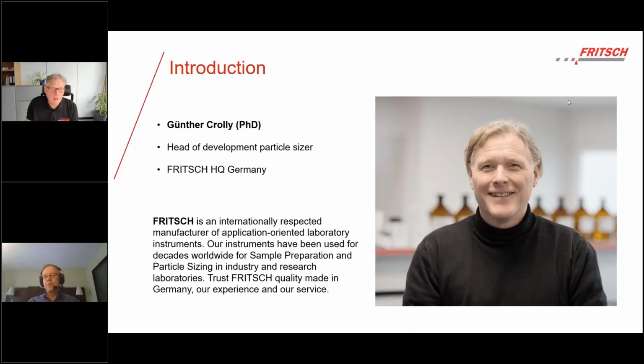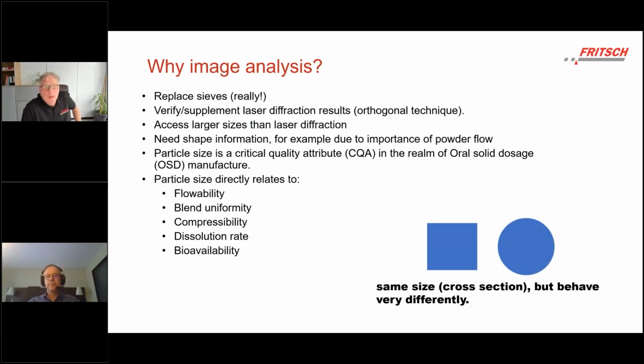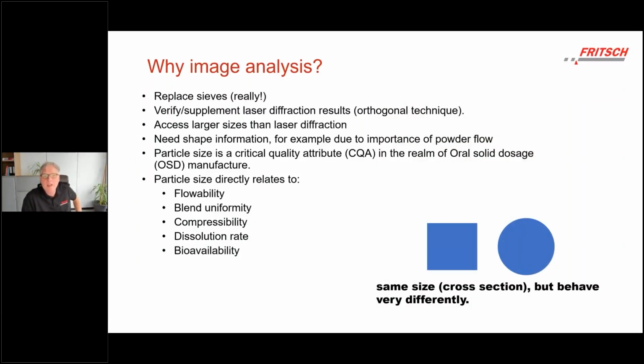Thank you, Jeff, for the introduction. Well, the first question that I want to talk about is, why image analysis? Of course, there are many different reasons to do this. And in fact, one of the reasons that we observe pretty often at customer sites is replacing sieves. And there are several reasons to replace sieves.